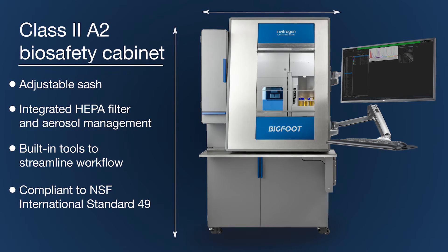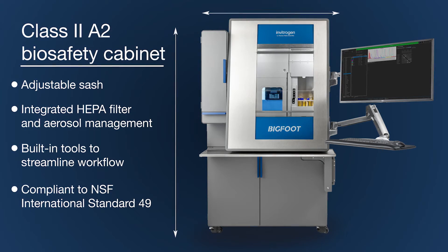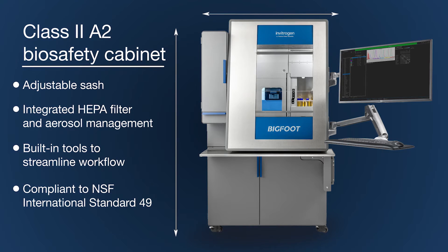The system has been verified to be functionally equivalent to the personnel and product protection standards for a class 2 type A2 biosafety cabinet per NSF International Standard 49.